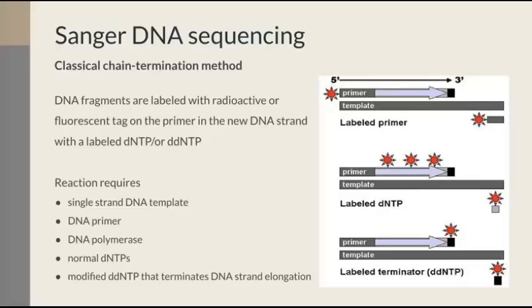And so you want enough fragments to be produced while you're still transcribing the complete sequence. But we also want to have a few of the fragmented and early terminated strands as well.